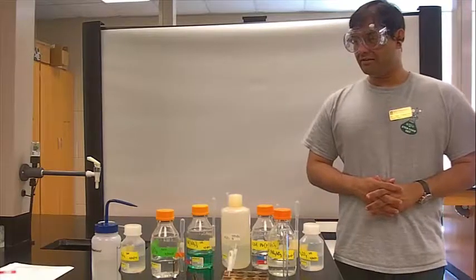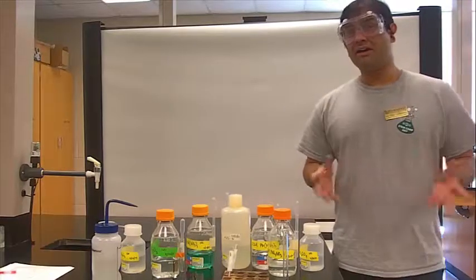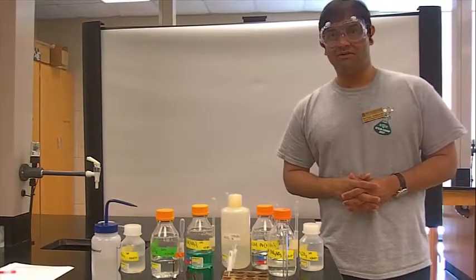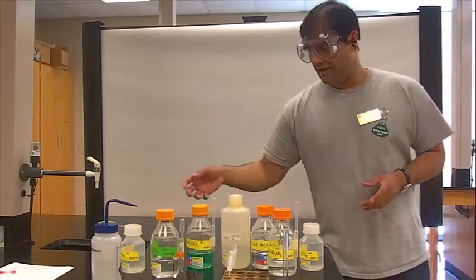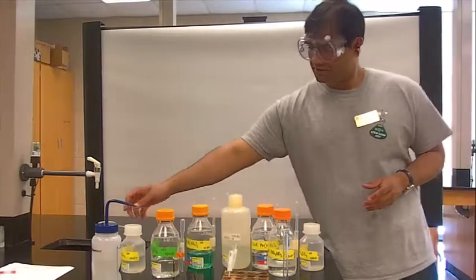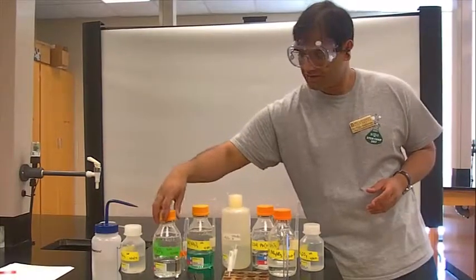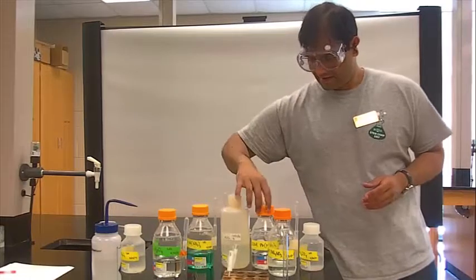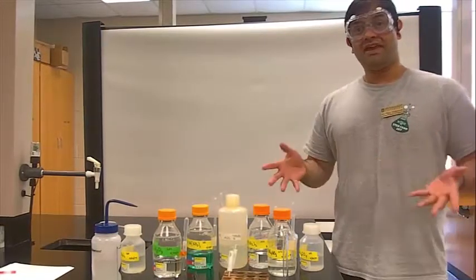For this lab, you'll be mixing reagents to determine if they are aqueous in solution or if a precipitate forms. A solution consists of a solute in the solvent. In all these cases, the solvent is water, so it's an aqueous solution. Here are some of the aqueous solutions that you will be mixing together in some combination to see if they react.